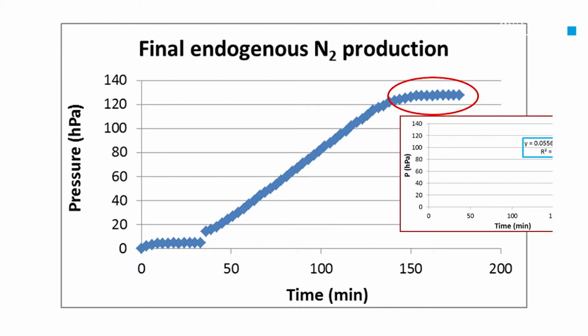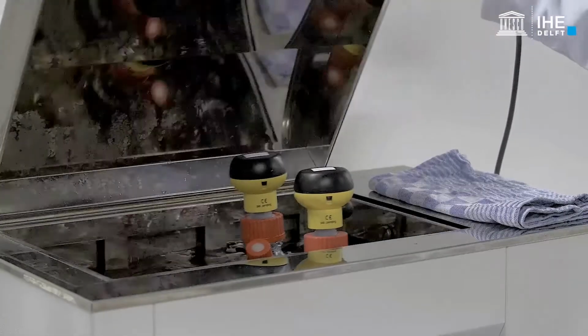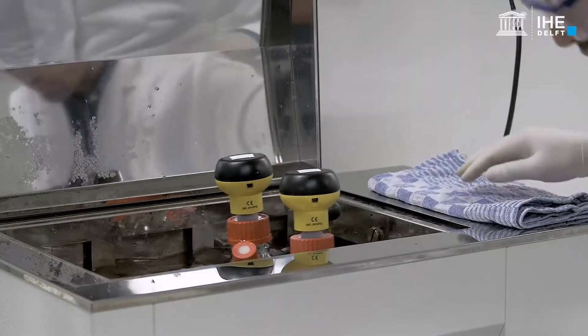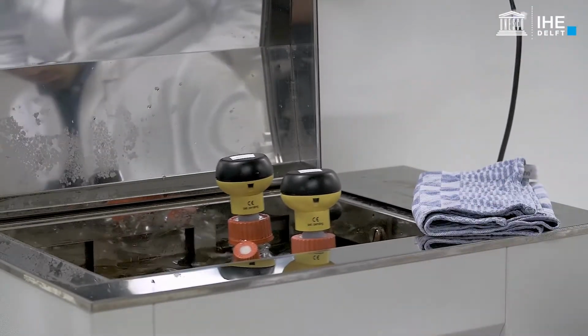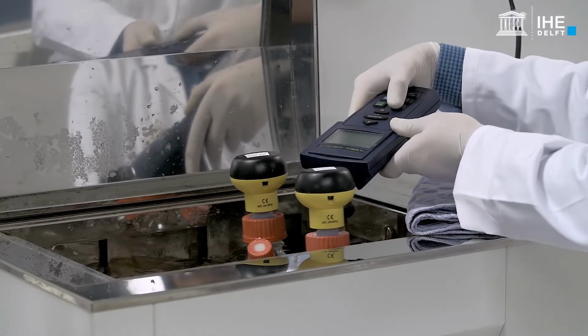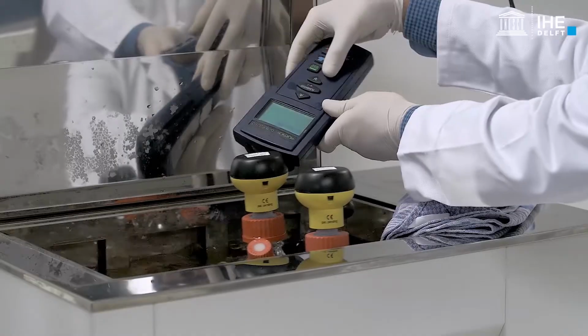Confirm that the mixing conditions and temperature are constant, since they could affect the pressure curve. The collected data should be sufficient to reliably estimate the nitrogen gas production rate through linear regression of the pressure curve data.